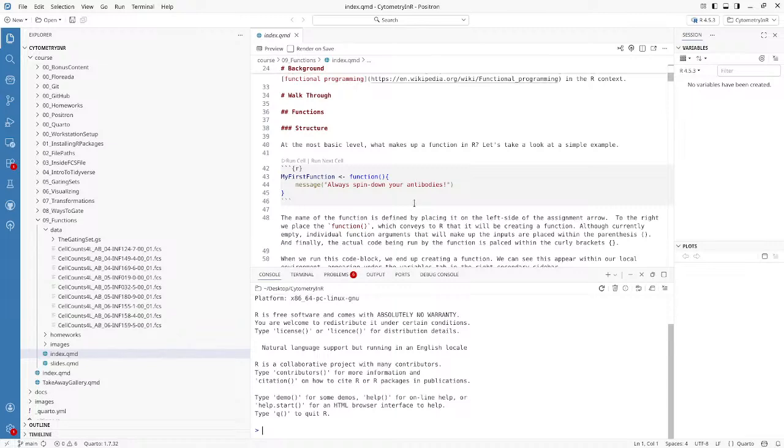It's basically what generates out the website. So if you're seeing the website and you're copying and pasting, you're basically just running those same lines of code that are present within this code chunk. So this data here is what we're going to need to be able to transfer out.